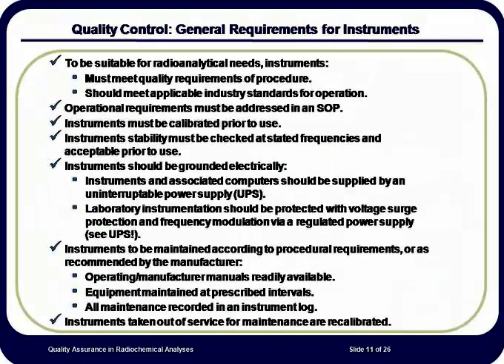Instruments must be calibrated prior to using them for making analytical determinations. Their stability must be checked at frequencies identified in the standard operating procedure, and acceptability criteria should be established prior to use. The electrical power for the instruments should have the properties noted in the bullets here. The maintenance requirements for each instrument should be in accordance with the manufacturer's operating manuals, and these manuals should be readily available.